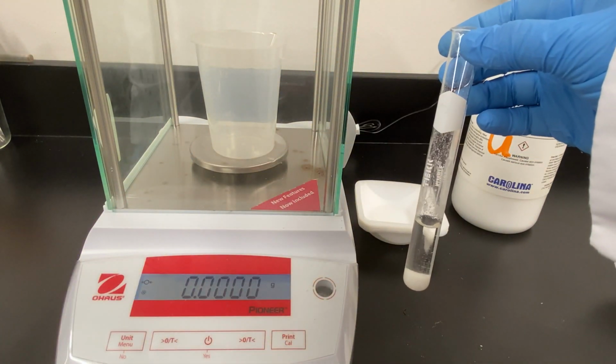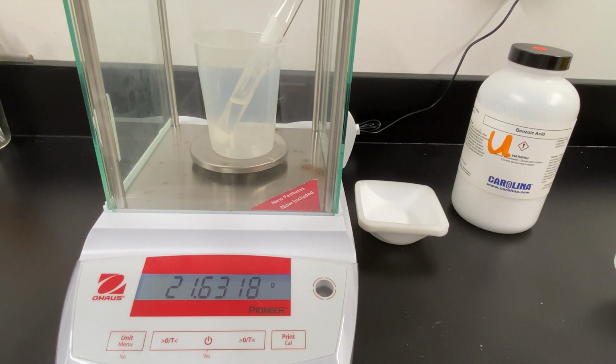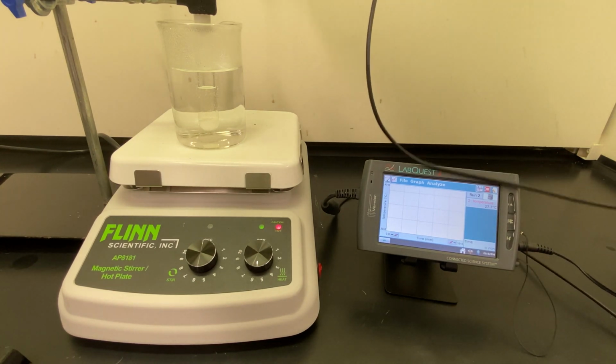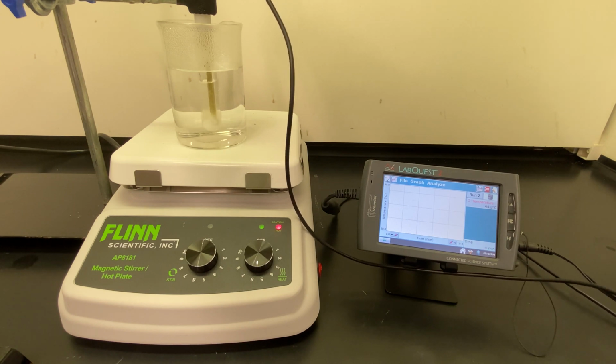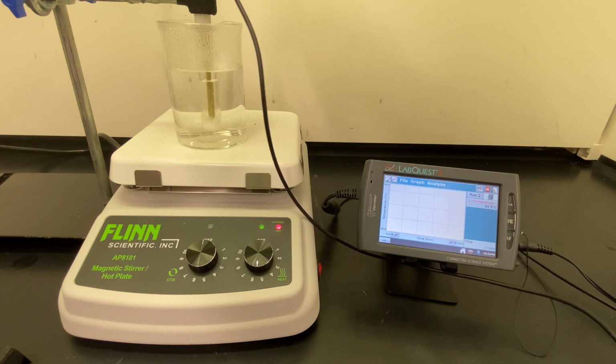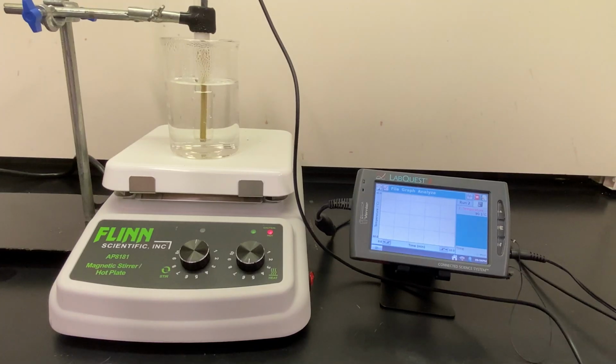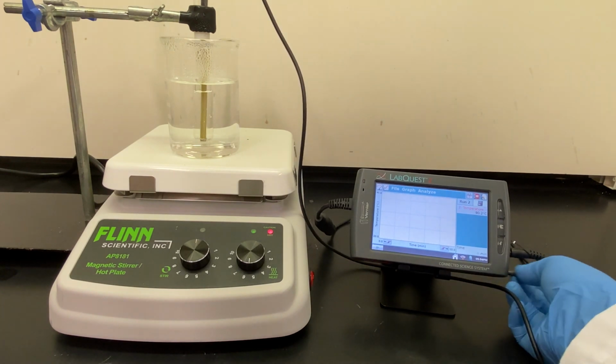Measure the mass of the test tube, lauric acid, and benzoic acid together. Place the test tube with the lauric and benzoic acid back into the beaker of hot water. Use the temperature probe to mix the solution until the benzoic acid is completely dissolved. Once the solution is completely dissolved, press play to begin collecting data.